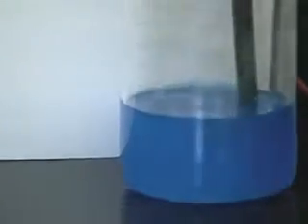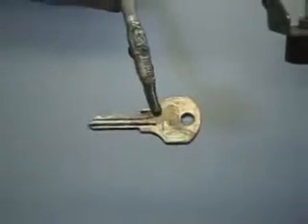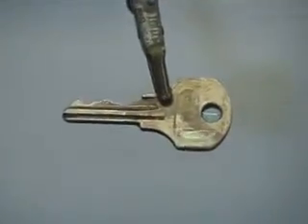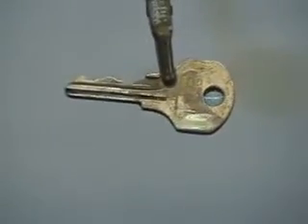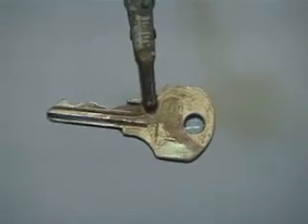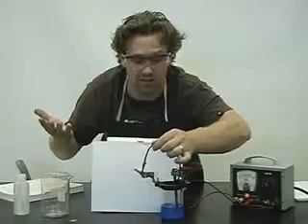So let's pull it out and take a look. You're starting to get that copper color forming on the key. Copper solid is forming as a top layer — that's pretty awesome. So the copper ions from the solution are being reduced to copper solid on my key. There we have it — the electroplating, which is electrolysis, of my key with copper.